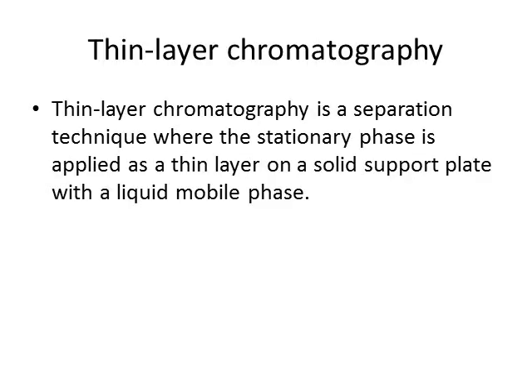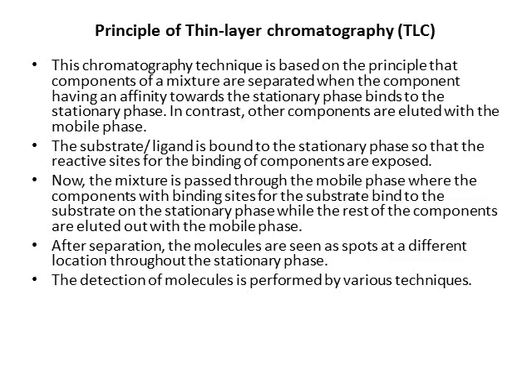The next is thin layer chromatography. It is a separation technique where the stationary phase is applied as a thin layer on a solid support plate with a liquid mobile phase. That is the only difference.